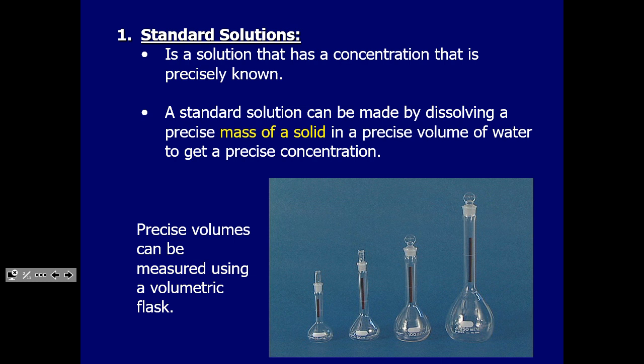You can create a standard solution by starting with a solid, right? And you weigh that on a scale, and then you dissolve it in a very precise amount of water. Now, solids we can get many significant digits on. Our scales, you've seen them, they have 2 decimals. So then if we've got something like 1.25 grams, we've got 3 significant digits.